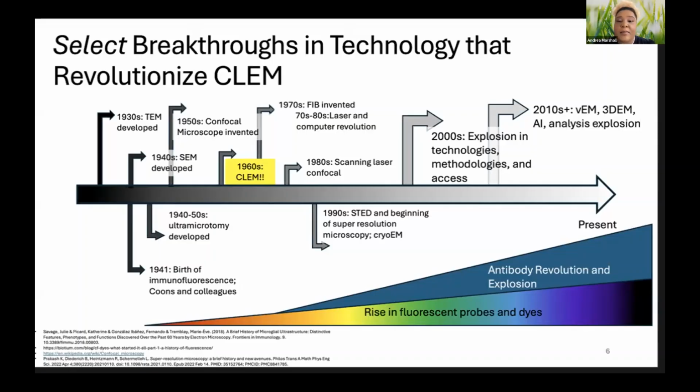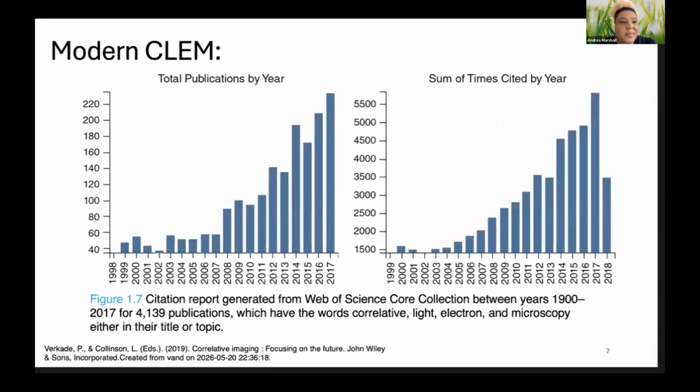And as well, in the late 2010s, you have the expansion and development of volume EM techniques, as well as 3D EM techniques, the development of AI, as well as 3D modeling and expansion of analysis tools, which really allows the world to be at your fingertips for what you want to discover.